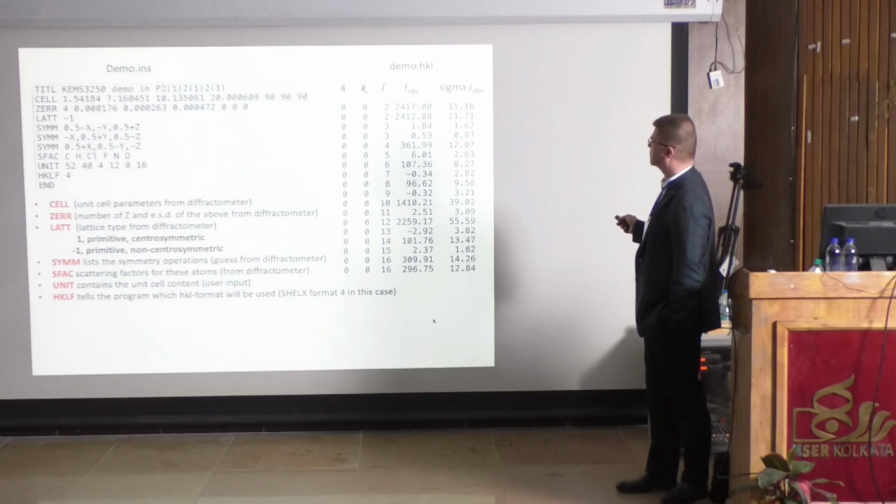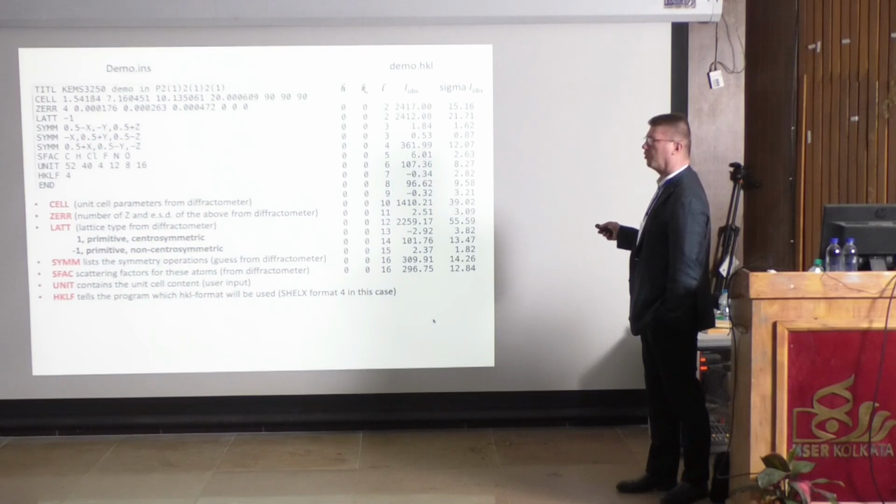Now you can see that it's a standard deviation, but now 003 is virtually 0. It means, okay, look, 003, where the L is odd, seems to be very small or 0. Look, 6, 0, 0, 3, minus.